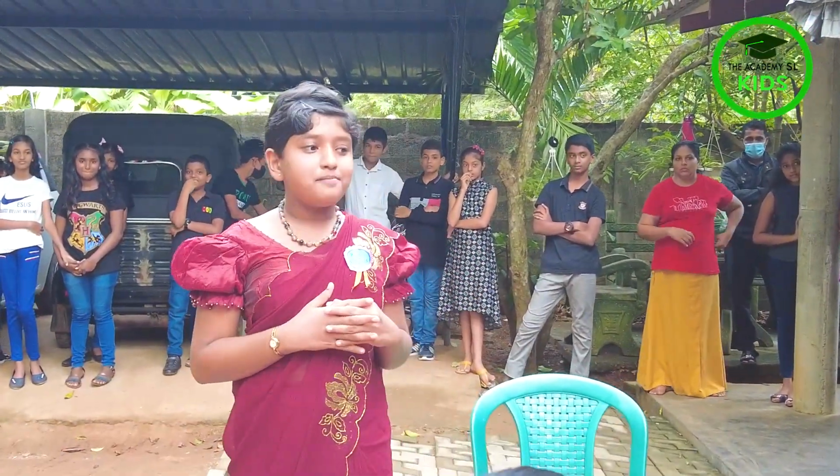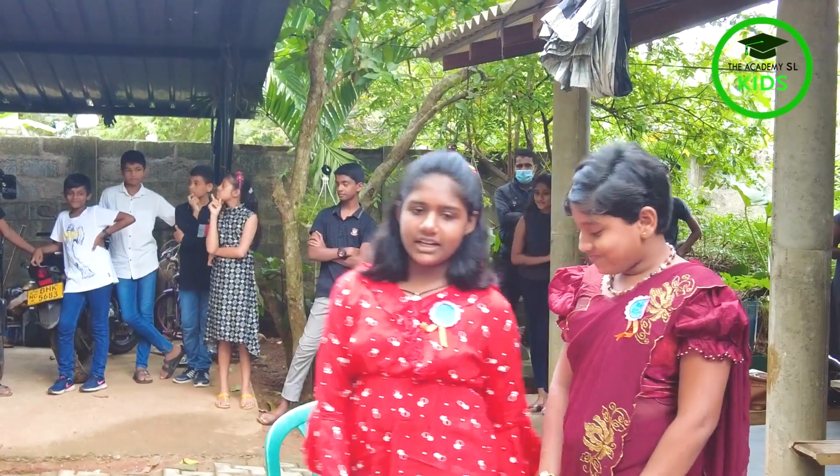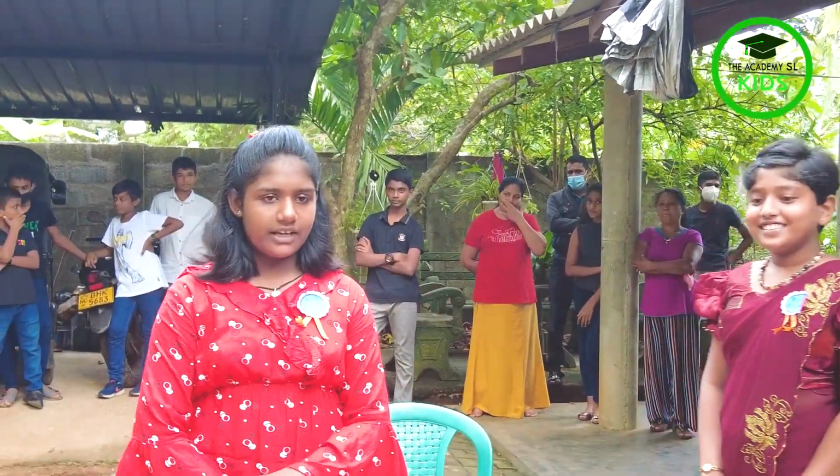What is called magnification power? Magnification power is the ability of a microscope to produce an image larger than its actual size.